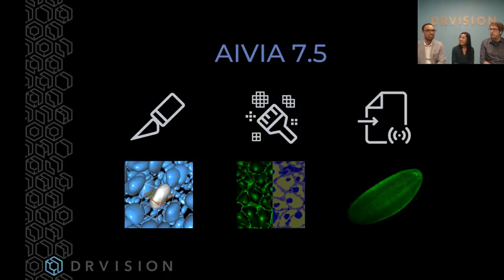But you can certainly train for 3D data, right? I mean, we can go through the steps, and if you use the 3D kernels or the 3D features, then it will take information from Z. You can also train in time, so you can go to different time points and train in different time points. We didn't really show that, but that's all possible, not only in Z, but in different time points to create the same classifier. If you were really interested in doing that, it would be possible just to flip your image around, so that the XZ was now your XY, and then you could train on that.